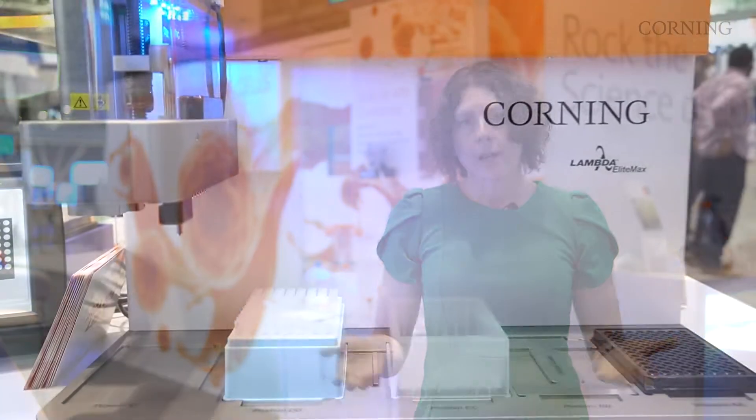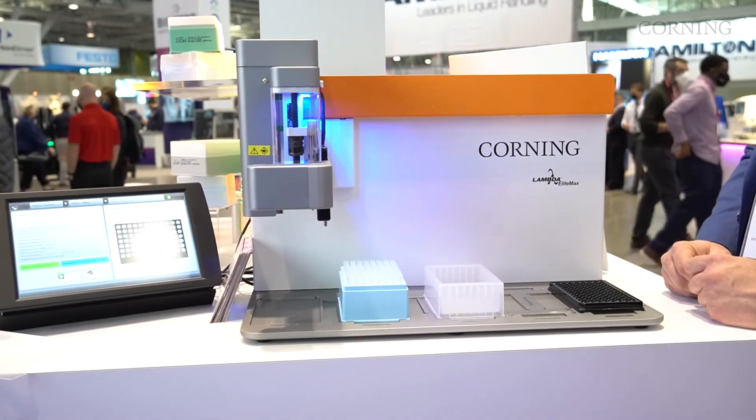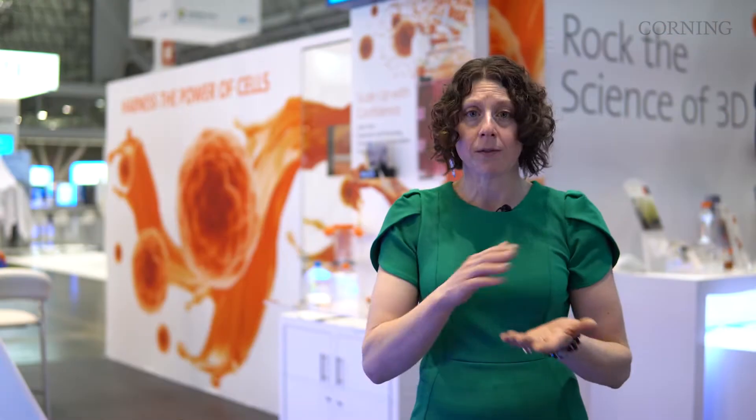The Corning Lambda Elite Max can help customers achieve better quality data, easier ergonomics, and a more economical platform. It is an automated platform for liquid manipulations using disposable pipette tips. It offers landscape and portrait formations for the benchtop and is easily movable in and out of the hood for all of your liquid manipulations.